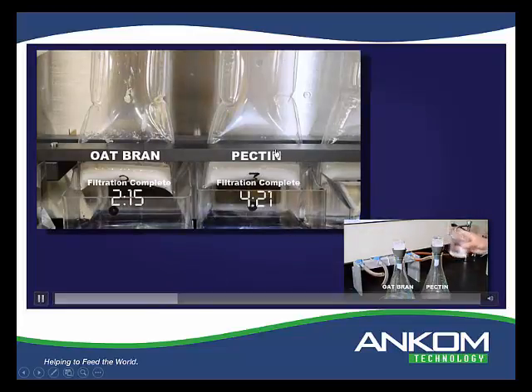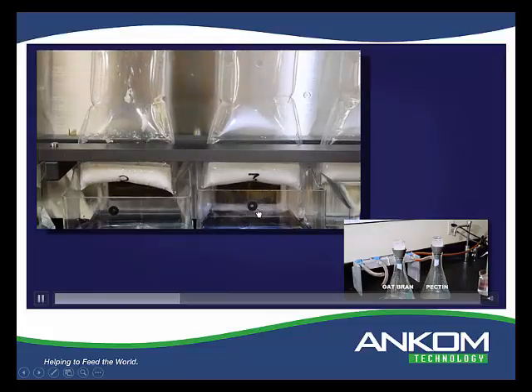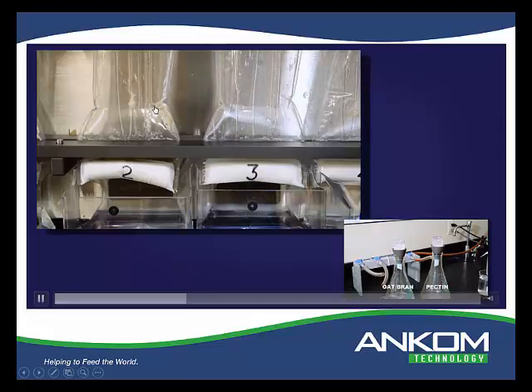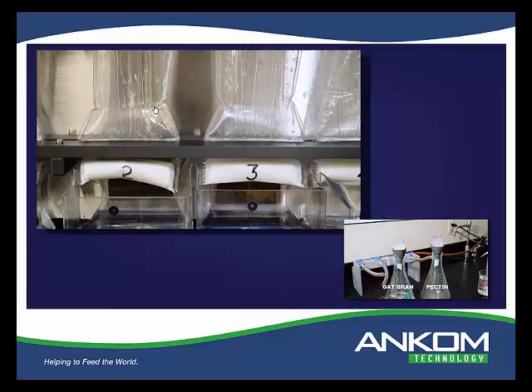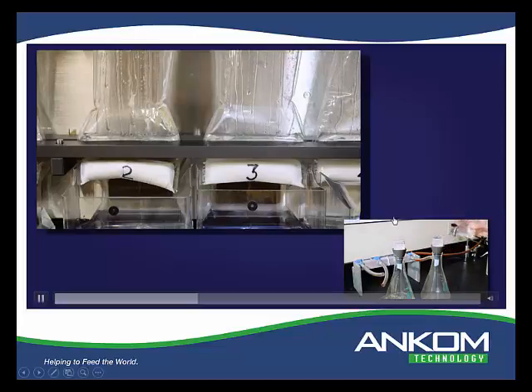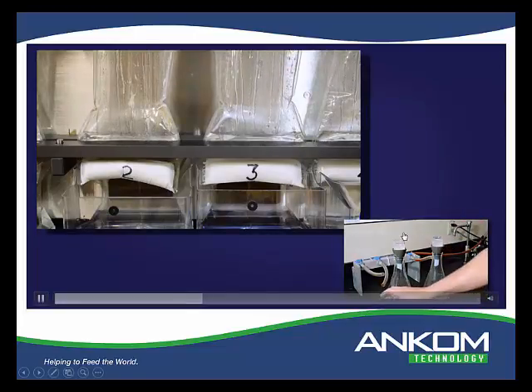There, the pectin finished its filtration in 4 minutes and 21 seconds. Now, over here, automatically, without technician involvement, the rinses take place. In the case of a total dietary fiber, we're talking about 2 78% ethanol rinses, followed by 2 95% ethanol rinses.